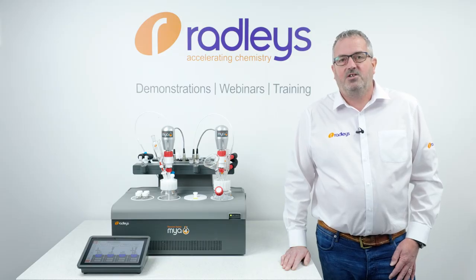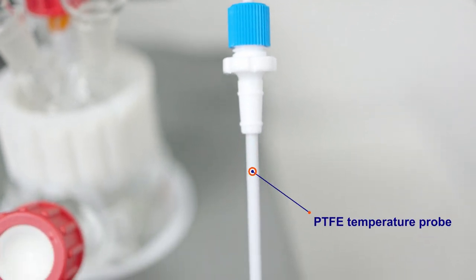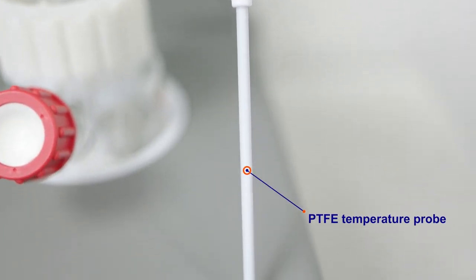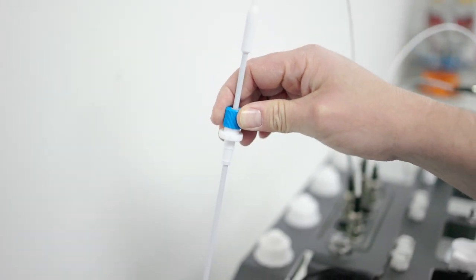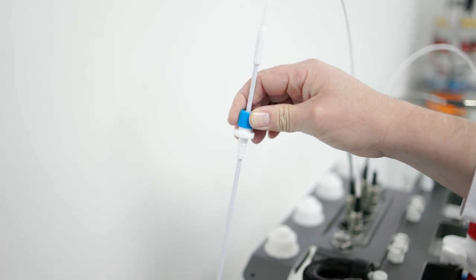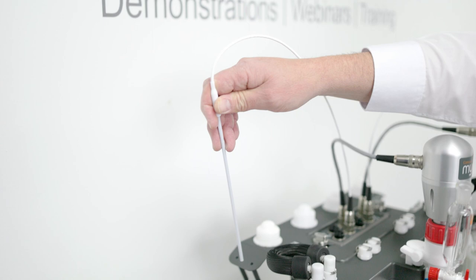Finally, I'd like to show you our newly designed external PTFE temperature probe. Our newly designed temperature probe has a PTFE encapsulation over a stainless steel core. It does have a thicker, more rugged design, but our tests have shown it performs equally as well as any previous versions.